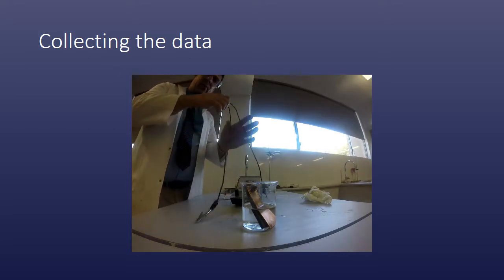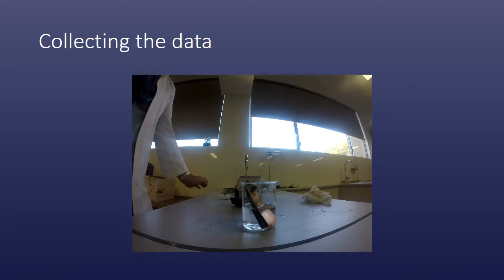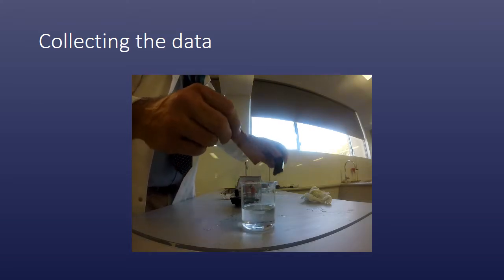So there's a couple of important things to be aware of here when we're looking at the conditions under which a galvanic cell is produced. The first and the most important thing is that our electrodes must be of different metals, must be of different substances. Sometimes the solution itself will be participating in the reaction, and other times it will simply be acting as an electrolyte, allowing the passage of ions to move from one electrode to the other in order to complete the circuit.